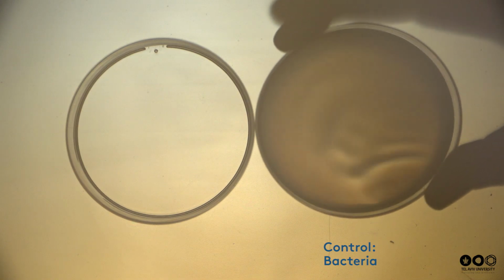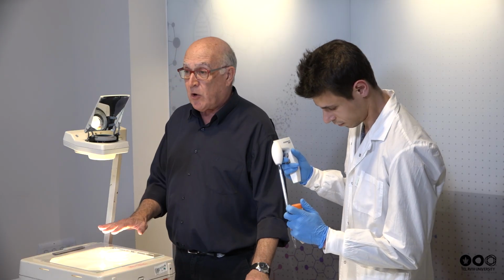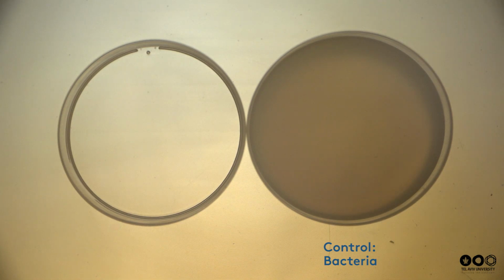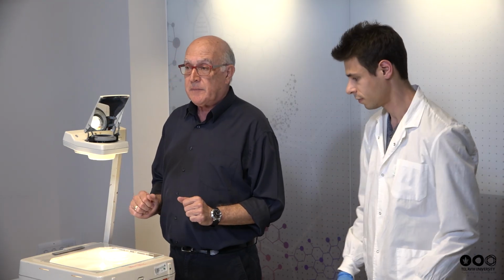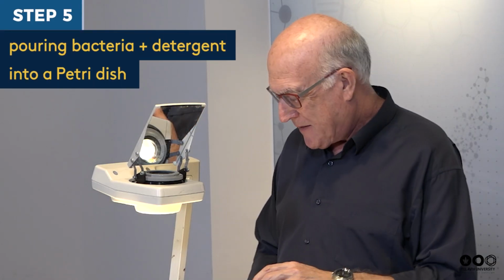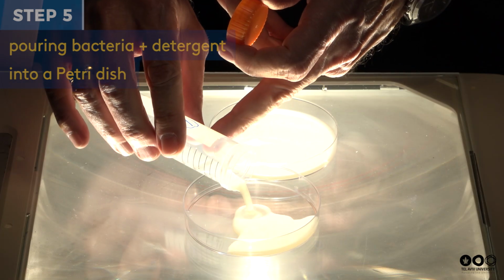And with a little wiggling and twirling, we can see the bacteria cover the total surface of the plate. And as you can see, it gives sort of a golden brown, turbid transmission. And what we would like to do is compare it to those bacteria that were affected by the detergent. Now please give me the experimental. Here it is, experimental. And we're going to pour that into the second Petri dish.